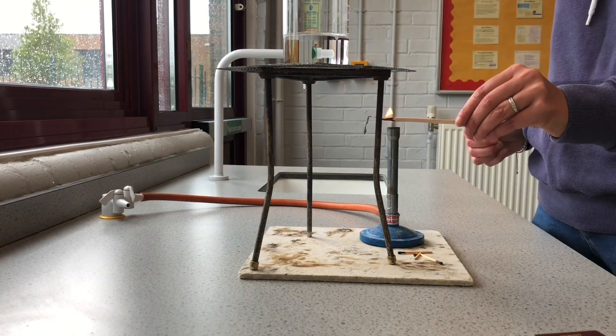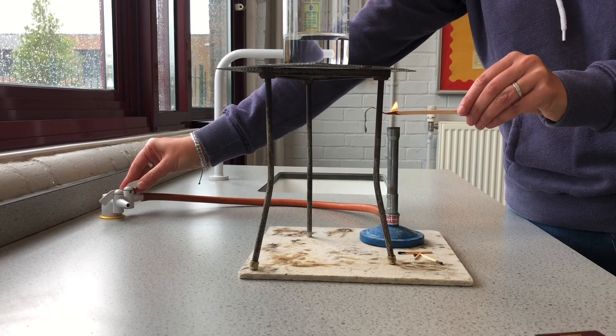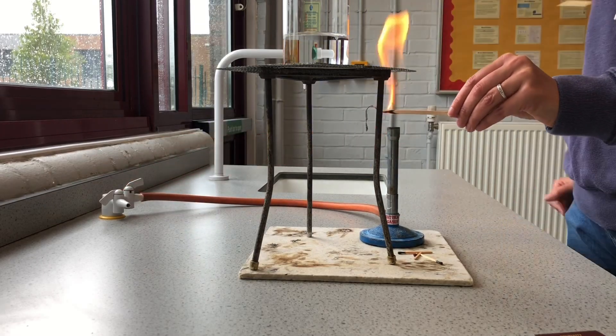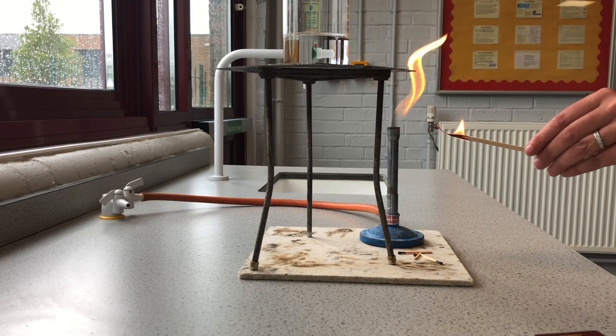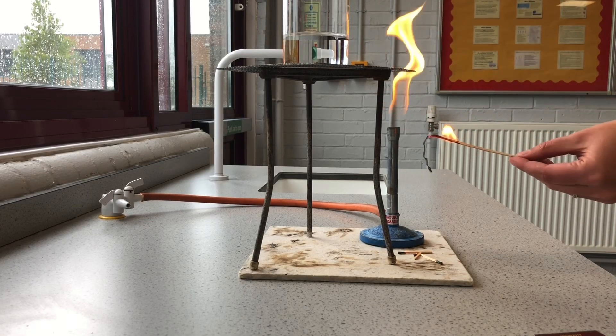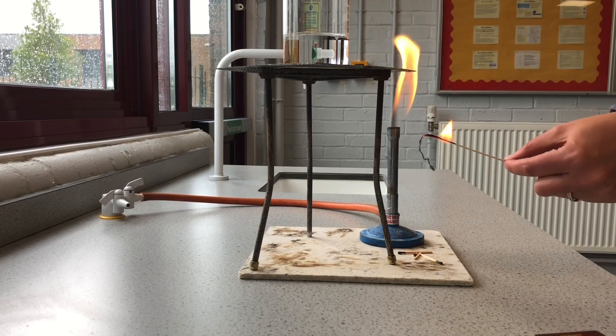I'm going to lift that and turn it, and the gas will come through — and I've lit my Bunsen burner, nice and safe on the orange safety flame. My splint is still burning and it's getting closer to my hand.